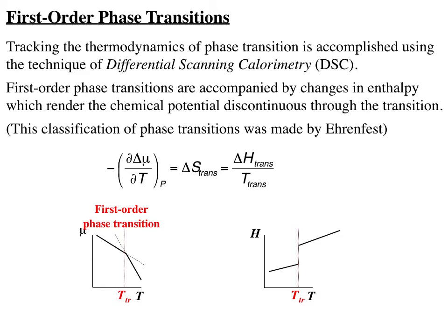Now, a differential scanning calorimeter can be useful to monitor such things. So maybe on the next slide, we'll say a little bit more about how this differential scanning calorimeter operates.